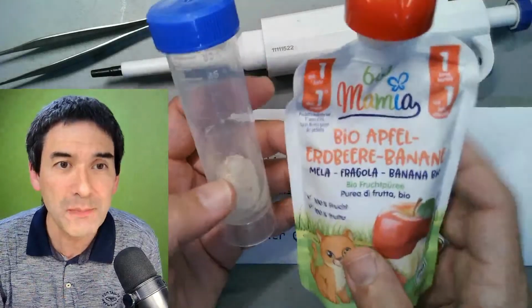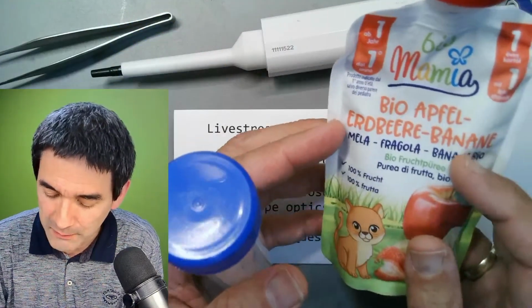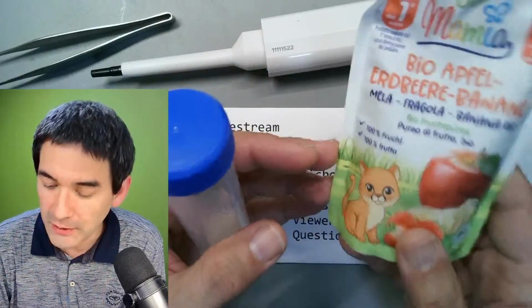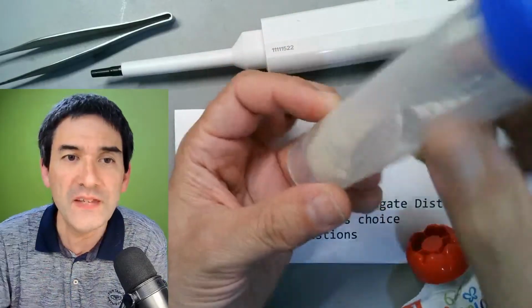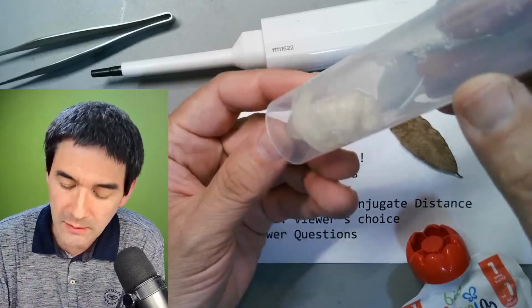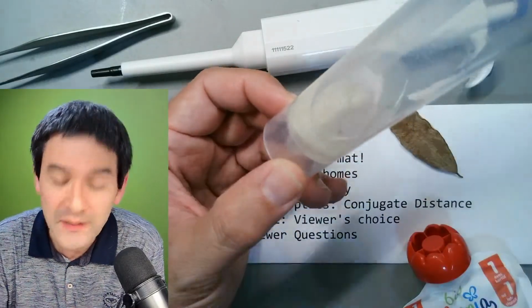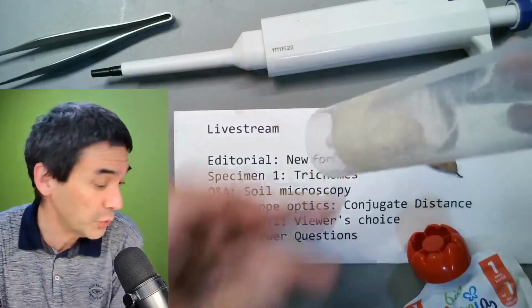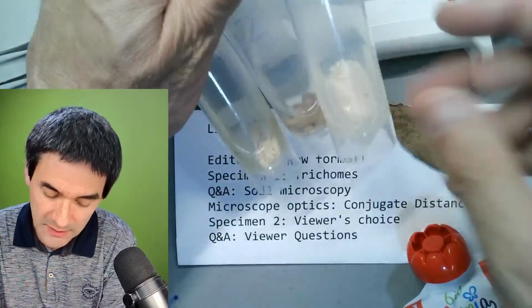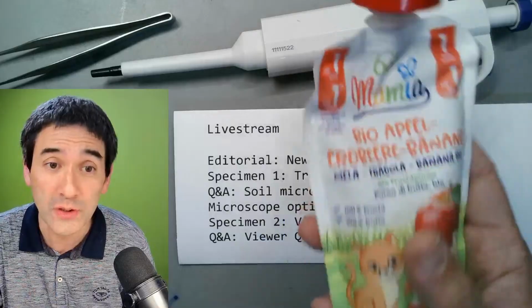I've got two specimens here. This one I just found at the supermarket. It's some kind of strawberry, banana, apple, mashed something, biological stuff to put under the microscope. Or this one over here is vegan meat. I think it's some kind of soybean thing, and it's also quite interesting. I already put it under the microscope before, and there is something in there that I also wanted to show you. I've got several of those. It's all in alcohol, that's why it's able to store. Or we can look at a couple of biological samples in here.